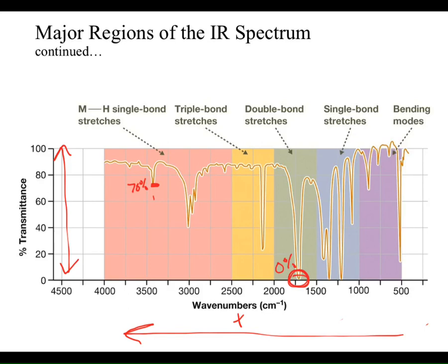Okay? So when we talk about IR signals, we can reference the intensity of the transmittance, or that peak. And it's usually strong, medium, or weak. So S, M, or W. Okay? This example here isn't the greatest, and unfortunately I don't have any in this video to represent this, but we also have another thing that we can compare. Not so much the intensity of the signal, but how broad the signal is.